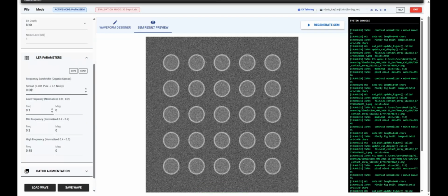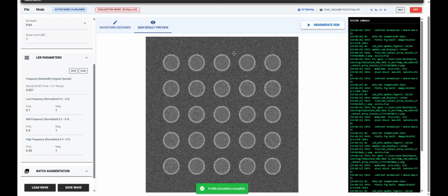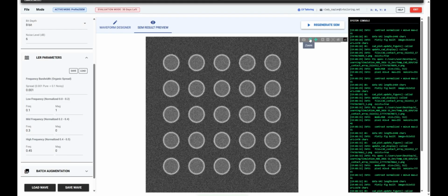Because the user directly dictates the ground truth topology, Profile SEM serves as an impeccable calibration standard for external metrology tools. Generating a mathematically precise, deterministic sample allows engineers to rigorously benchmark independent metrology inspection algorithms. When a measurement system evaluates these synthetic images, any deviation from the original 30-point curve immediately isolates algorithmic bias. This capability is paramount for validating advanced computational metrology software before deploying it on physical wafers.